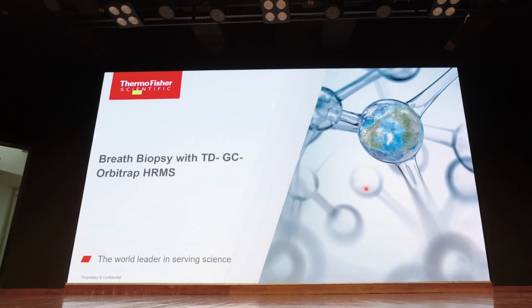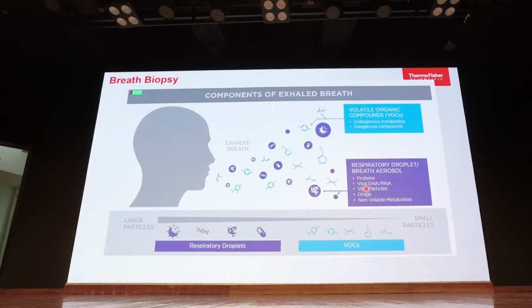You analyze the breath of the patient, and vapor tells you a lot of the story of the disease which is existing in the patient. It's a totally non-invasive technique that we are using. So a patient or an individual, when breathing out, exhales a lot of VOCs. And they contain a lot of information. They tell you the current metabolic state of the individual.